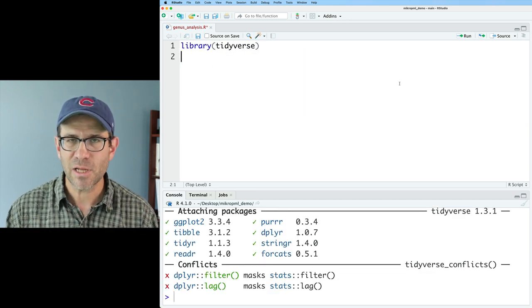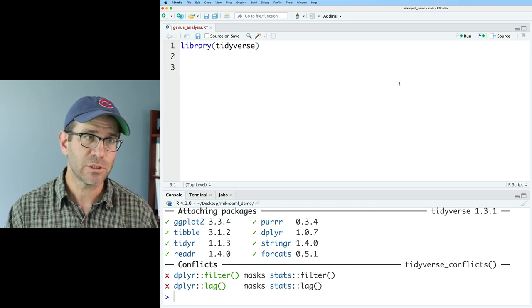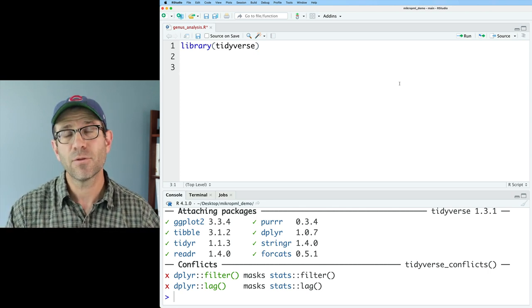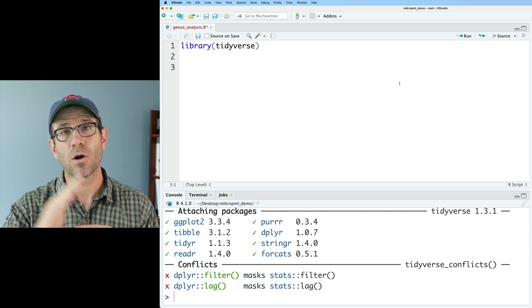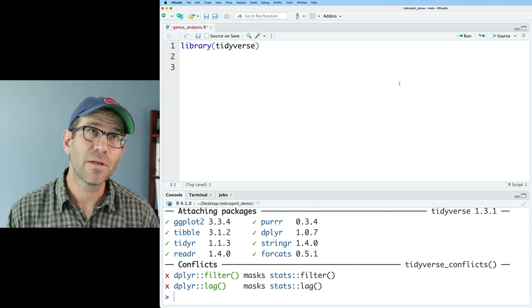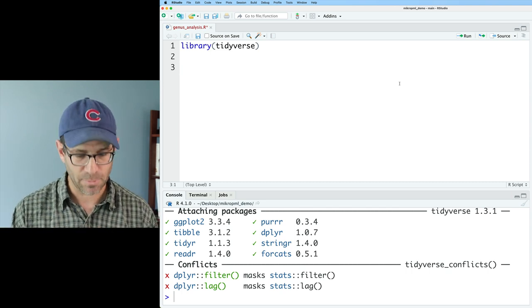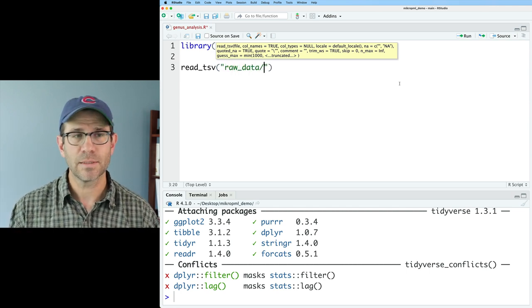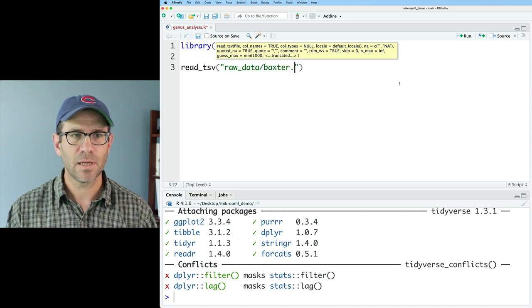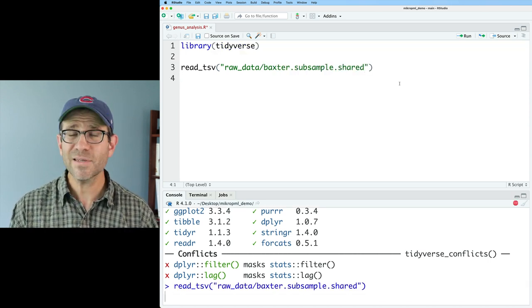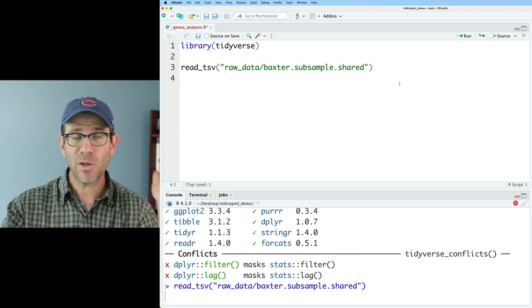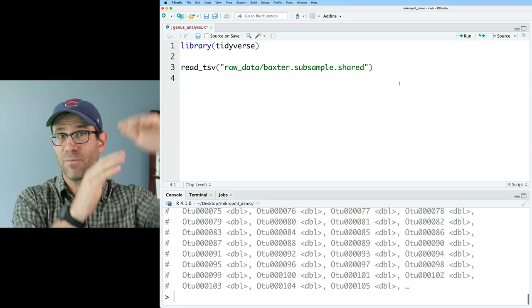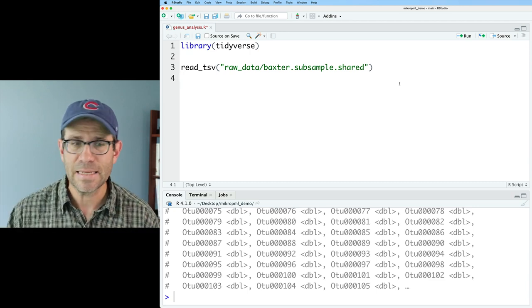We now have all that great tidyverse functionality loaded into our R session. The first data frame that I want to read in is my shared file. The shared file is generated by mothur, and the rows are the different samples and the columns are the different OTUs or the different taxa, and the cells are the number of times each OTU is seen in each sample. We can do read_tsv because it's a tab-separated values file, and we'll read from the raw data directory: baxter.subsample.shared. This takes a moment or two to load because the data frame is very wide. R does not like working with really wide data frames — it much prefers a longer, tidy data frame.